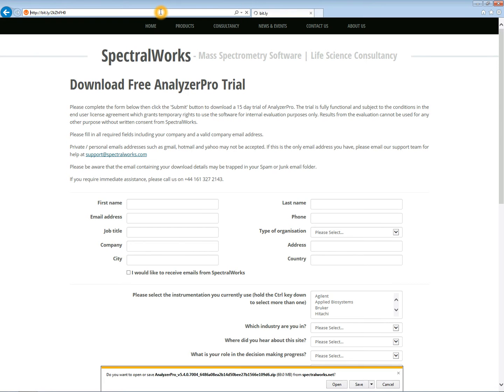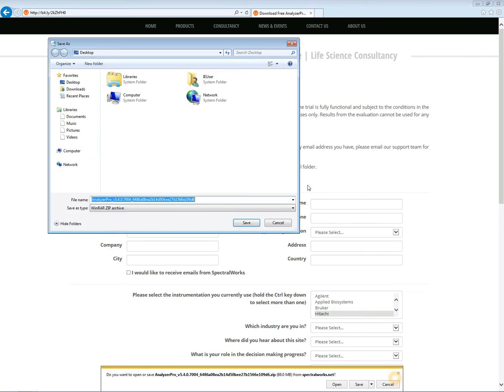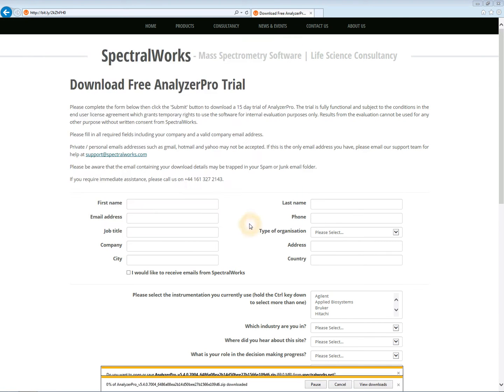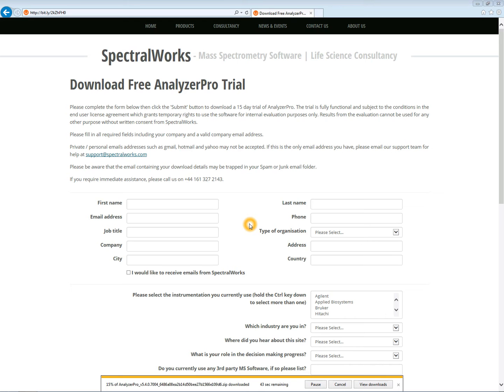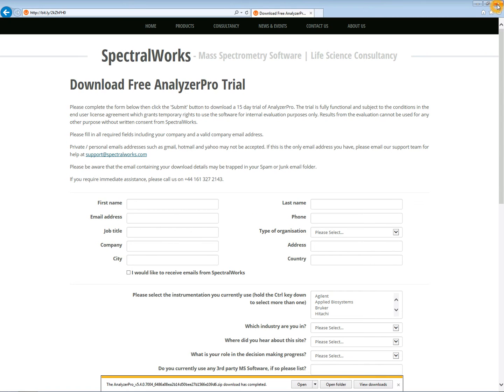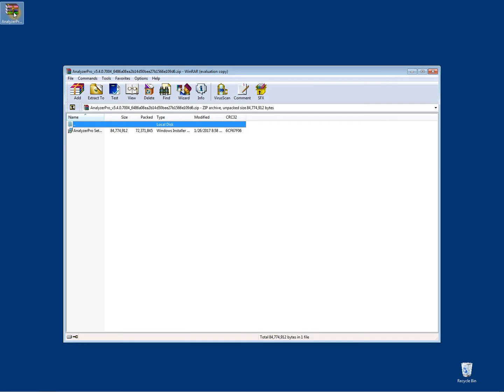You then need to download the software from the link and save it to your desktop. Once downloaded, you can unzip the Analyzer Pro setup.msi file.